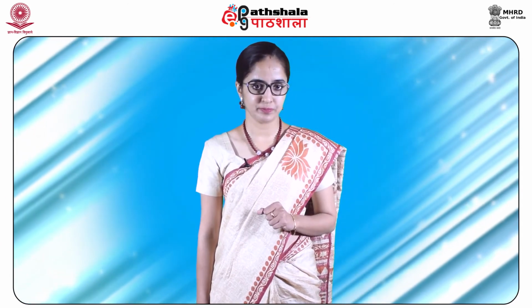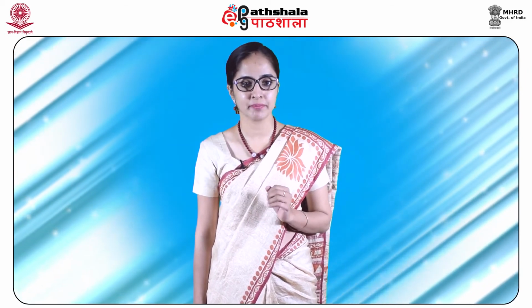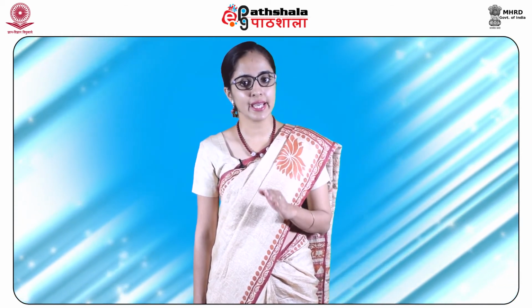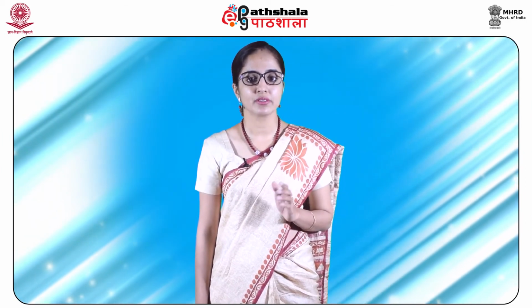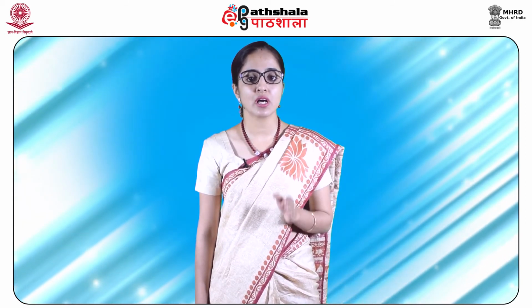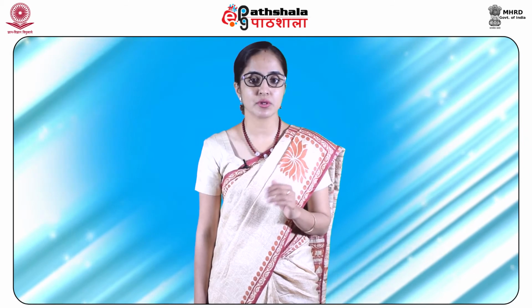Now, why is that? The observation can be explained by considering the rapid rate at which ring flipping occurs at room temperature. The NMR spectrometer is too slow to acquire a spectrum of a single chair conformation. While the spectrometer is acquiring the spectrum, the ring flipping is rapid between the two chair conformations, producing a blurry picture. The spectrometer only sees the average electronic environment of the protons, and hence only one signal is observed.